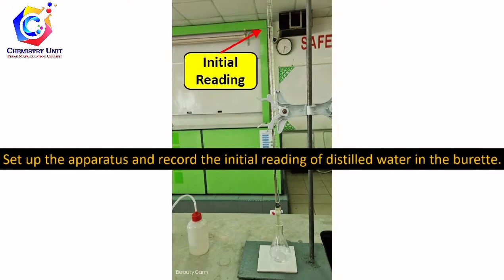Set up the apparatus as for titration and record the initial reading of distilled water in the burette.